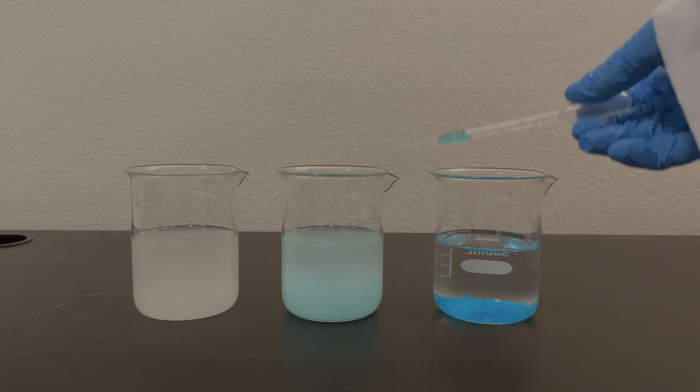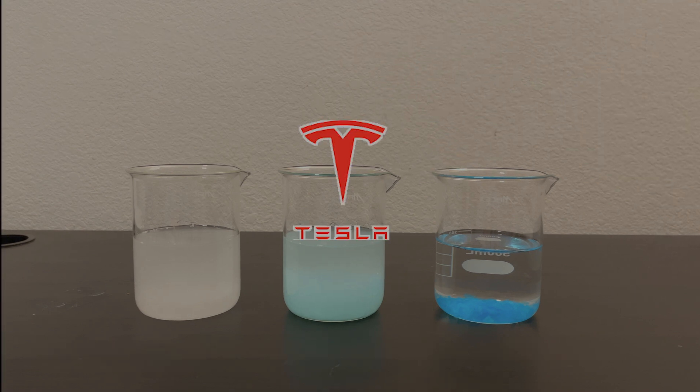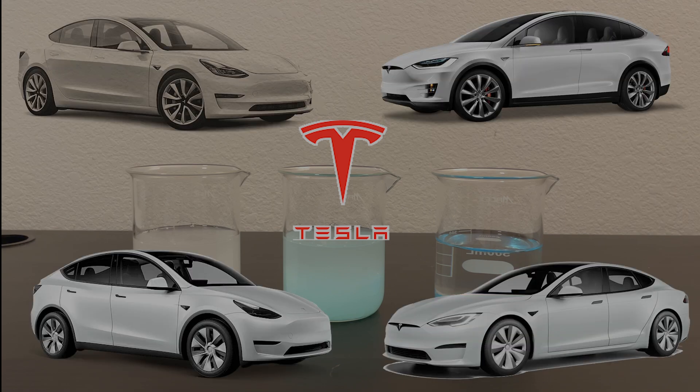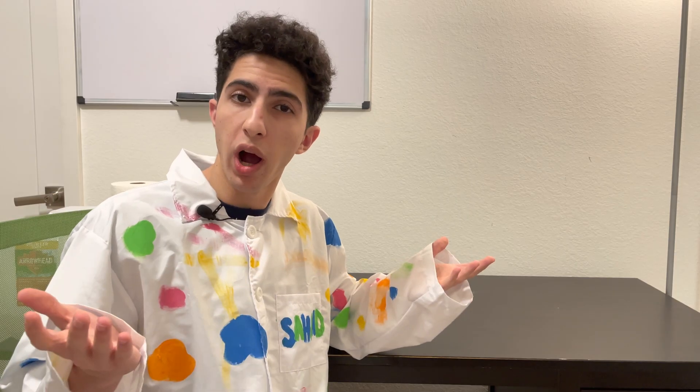The color of this solid mixture is a lot like Tesla's car design. No matter what you do, it will always be the same. Why? Well, this is because both precipitates are formed in constant proportions. In this case, equal proportions.